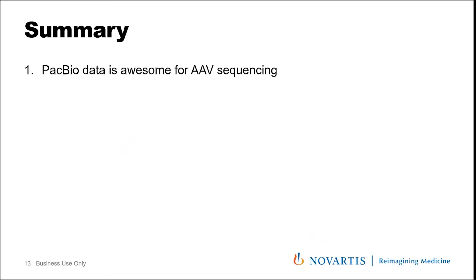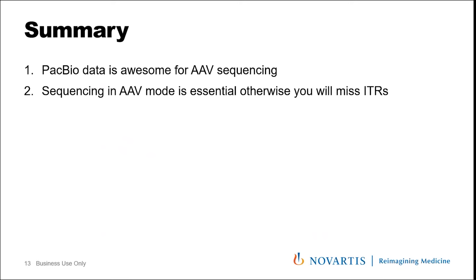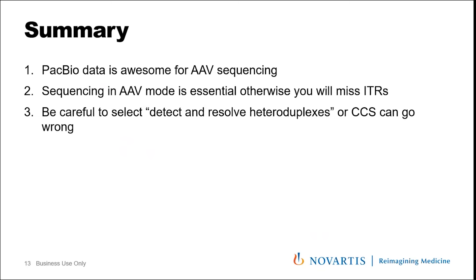To summarize: PacBio data is awesome for AAV sequencing. Sequencing in AAV mode is essential — otherwise you will miss the ITR sequences because they will by default be removed by the standard processing that gets rid of SMRTbells. Be careful: make sure that 'Detect and Resolve Heteroduplexes' is also selected — it is selected by default, so just resist the temptation to deselect it, otherwise CCS will go horribly wrong. It's easy to tell if this has happened because you will have very low quality reads that are 4 kb long — where you'd normally expect Q90, you might see Q5 or Q10.